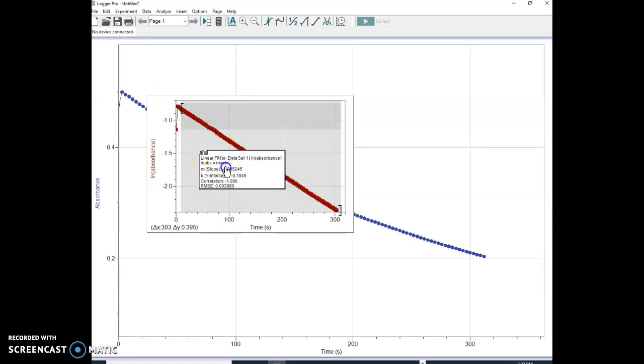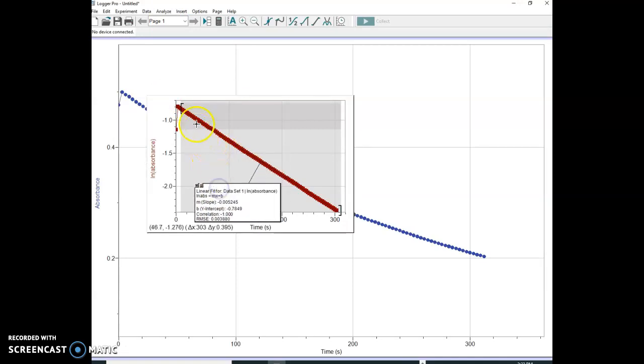And we have created a linear fit. And that straight line does not deviate from these points, these colored points, at all. Moreover, it gives us the information we want. The natural log is equal to mx plus b. We've seen that that's a linear relationship.